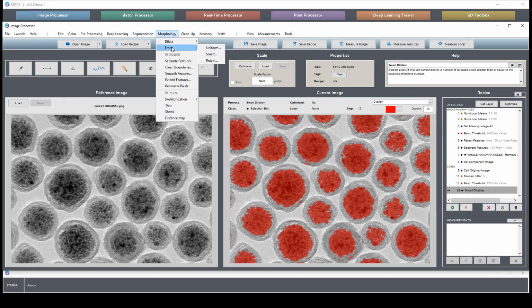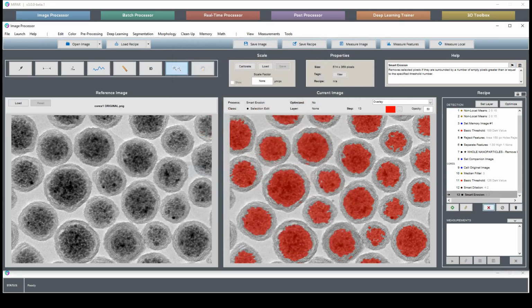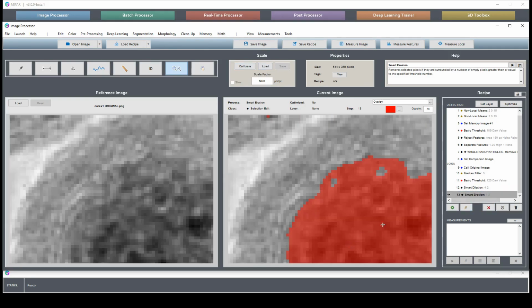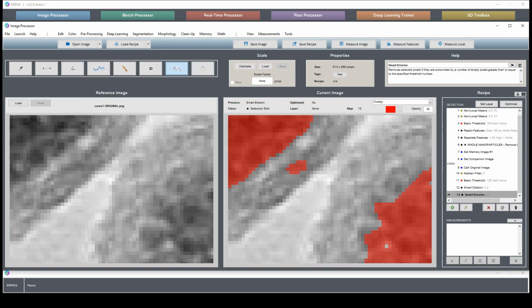And so now we can run the opposite, a smart erosion. If we set the same parameters of 2, threshold of 4, 2 iterations, where does that leave our edges? Roughly the same spot. With our pre-cleaning now, we can do a little bit of morphological processing to make these a little bit better. See if we can get some joining here without inadvertent connections here.